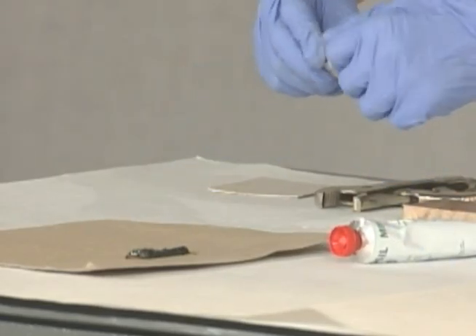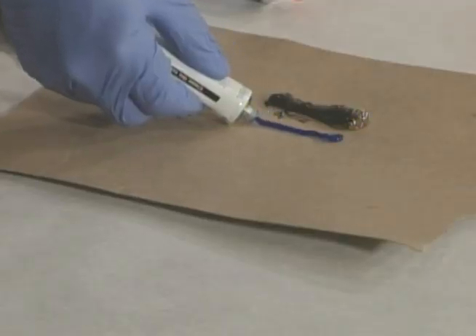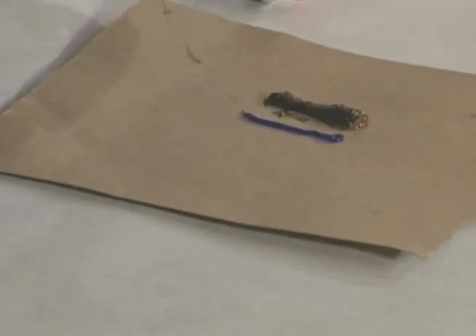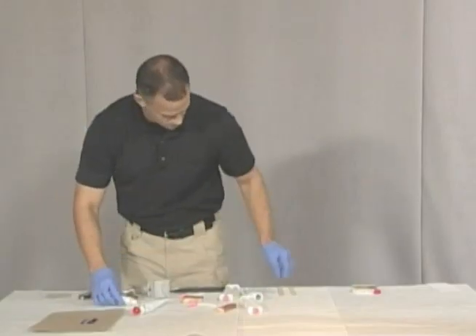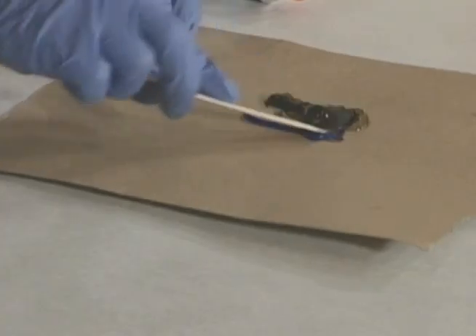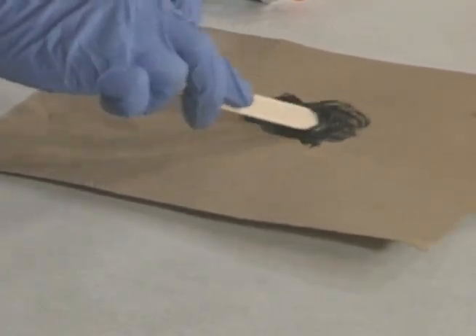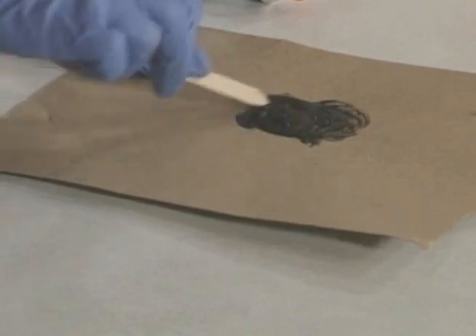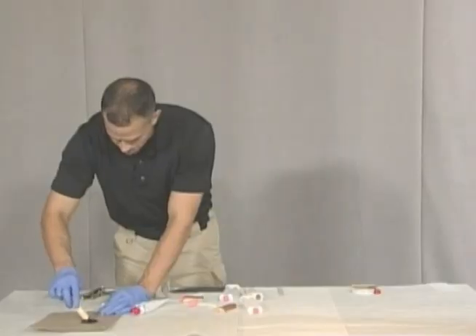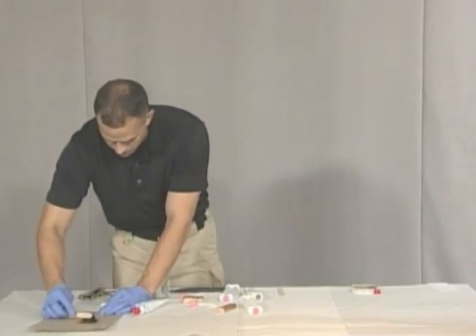We're going to make an equal length line using the hardener. I'm going to use one of our wooden spatulas and we're just going to mix those together. You're going to mix that together for about a minute, because the working time before it starts to harden is about a minute.